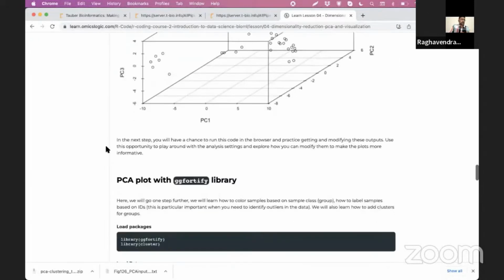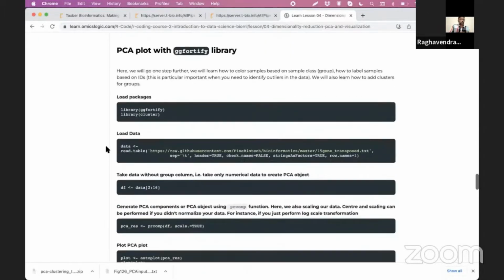In addition, as I mentioned, when you have the sample characteristics available for your input table, we can load those sample characteristics into a separate object, and use them to color the samples and their distribution in the principal component analysis output, so that we can understand whether the PCA's variance explained actually separates the samples according to the different characteristics that we associate the samples with.